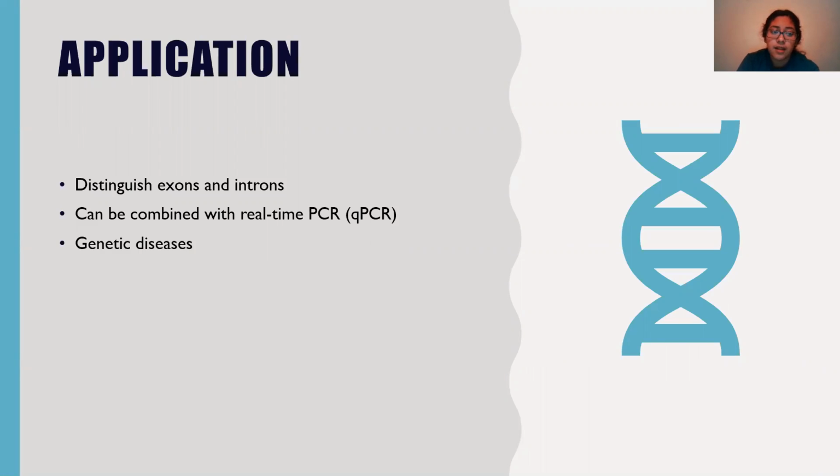This technique is applied to distinguish exons and introns. It can sometimes be combined with real-time PCR in order to quantify mRNA levels and also to diagnose genetic diseases as well.